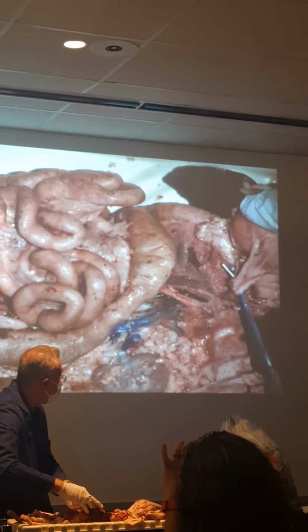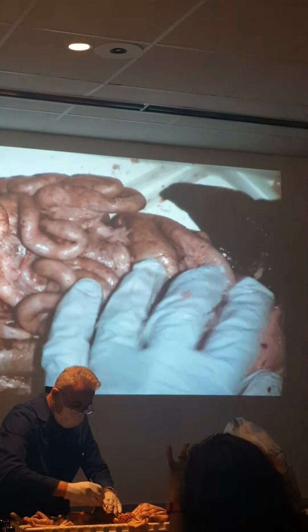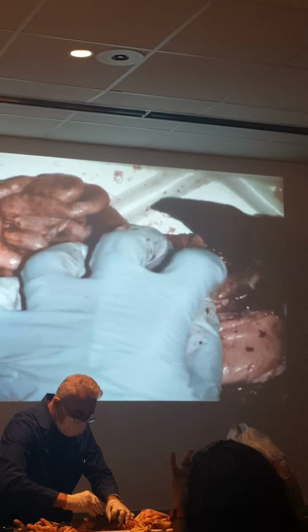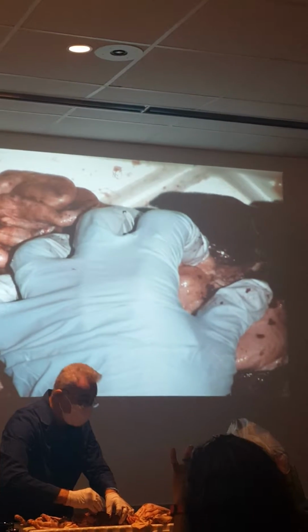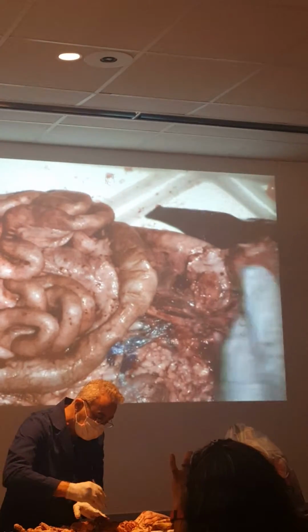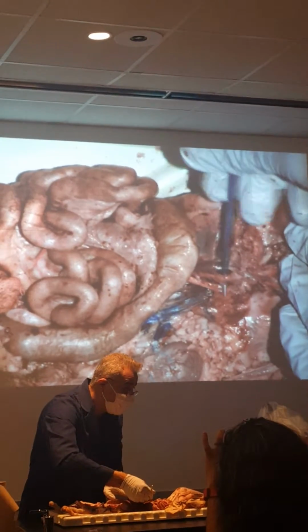What do you call that? And then goes to the liver, hepatic. It's a little bit buried down here, but it's hepatic. It just goes to the liver. Just watch, just see where it goes. So that's celiac. A major blood vessel.